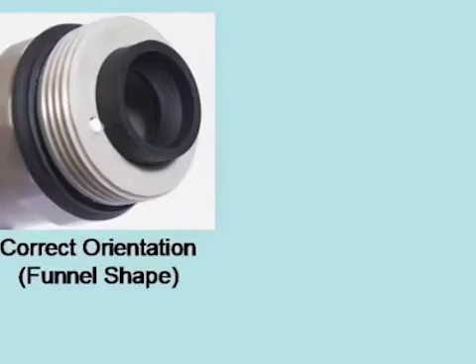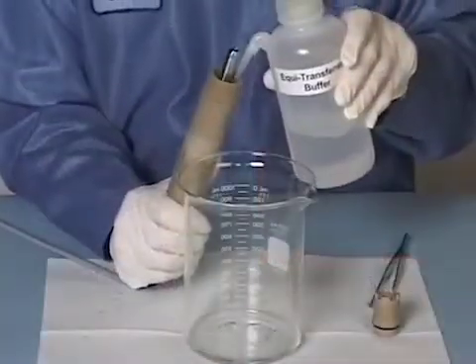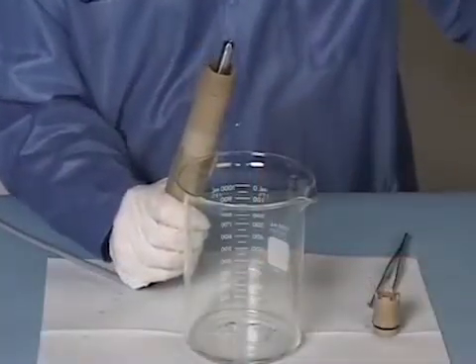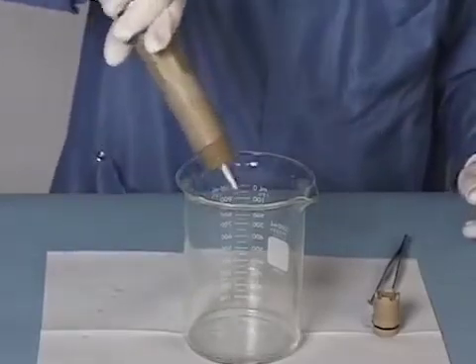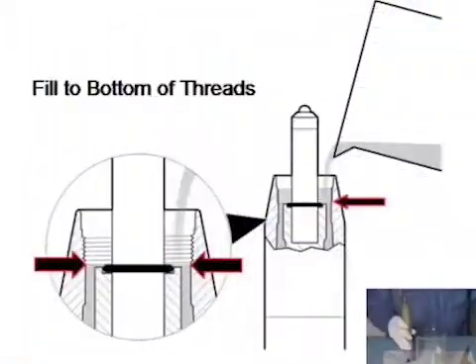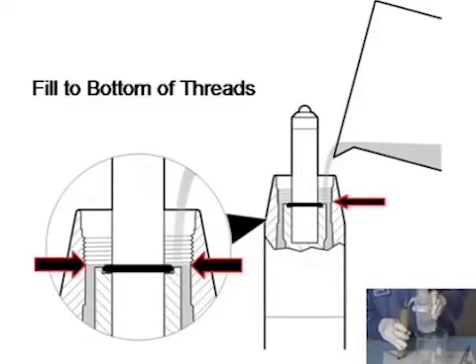Proper orientation of this gasket is vital in ensuring your pH sensor performs correctly. When properly seated in the salt bridge, the funnel-shaped side of the gasket must be facing out. Rinse the reservoir with equitransferent buffer. For ease of use, we have filled a squirt bottle with the buffer. Fill the probe reservoir with fresh equitransferent buffer solution to the bottom of the salt bridge threads.